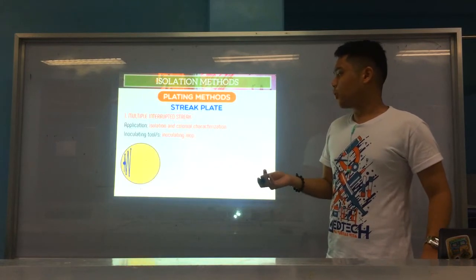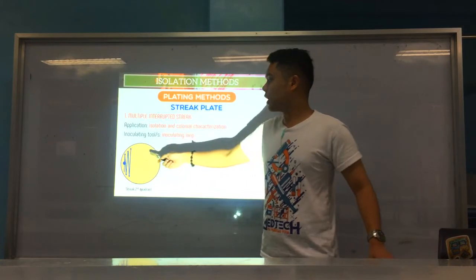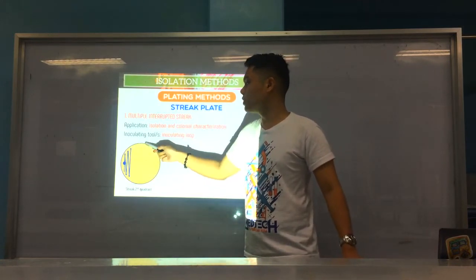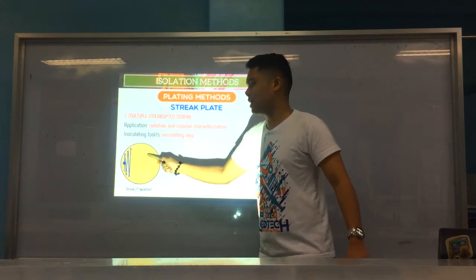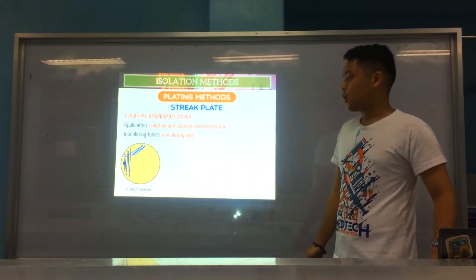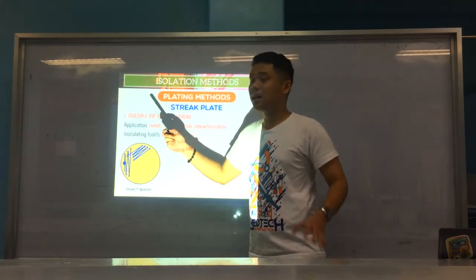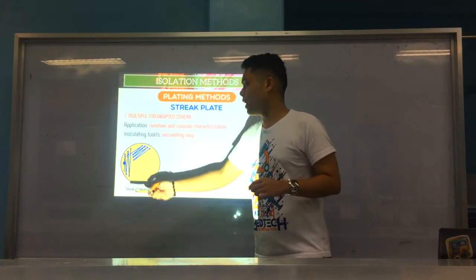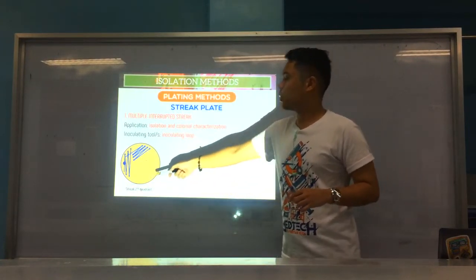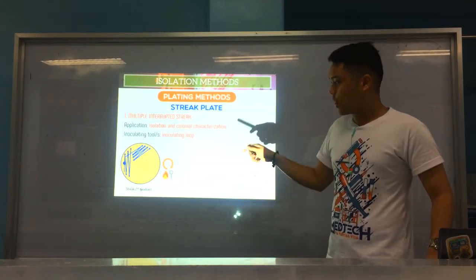Okay, next one is of course from the first quadrant. After heating, you streak the second quadrant. Usually you touch the first quadrant once or twice. You can touch it once and then go straight to streaking here. That's for your second quadrant. Usually you touch it once or twice, it depends on you, but I usually touch once or twice. But okay, touching the first quadrant once would suffice. Okay. And then flame the loop.